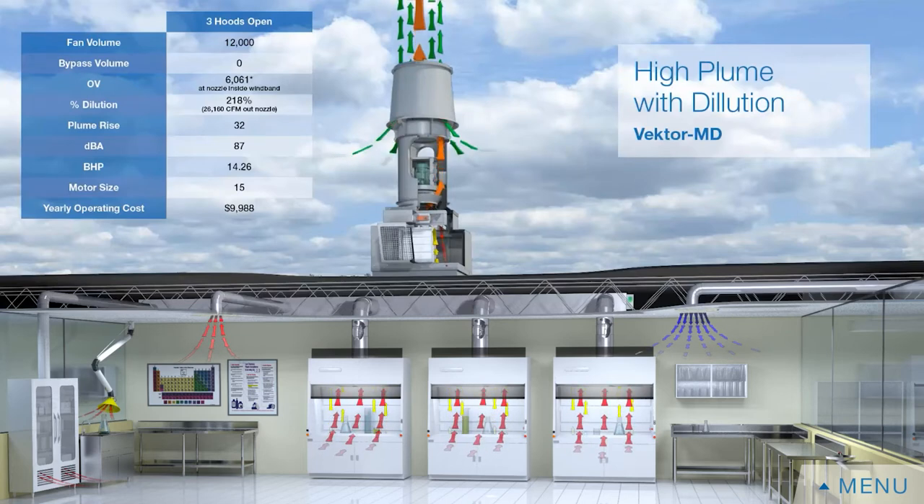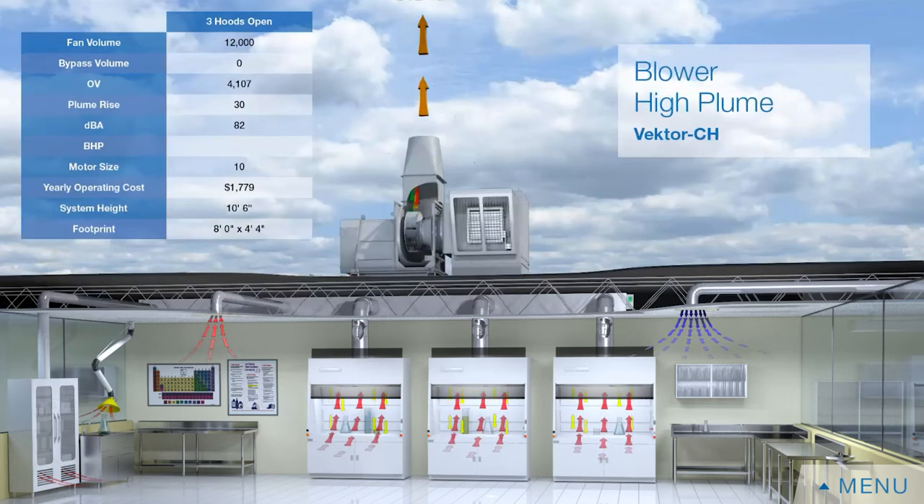The alternative to an inline fan is a centrifugal fan. A centrifugal fan can have a bypass plenum with a bypass damper so air goes in through the box, into the inlet of the fan, and exhausts up above the product.